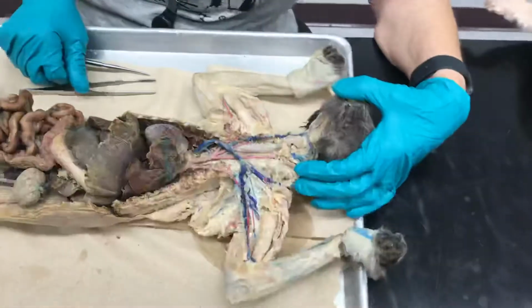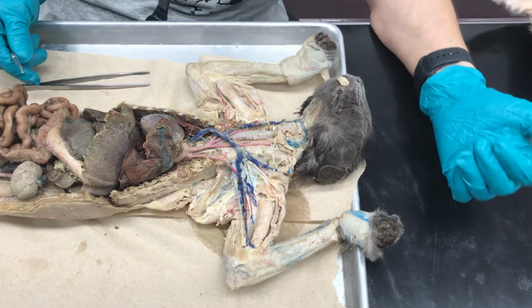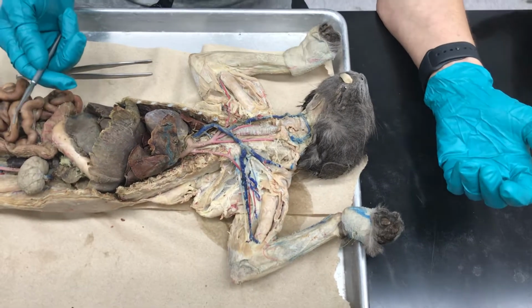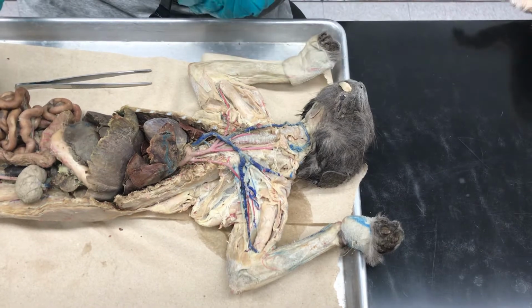We are going to look at cat vessels now. Cats and humans have basically the same vessels, and it's really beneficial to look at them on the cat because we obviously can't look at them on the human. What I'm going to do is we'll do this in two separate videos. We'll do arteries and then we'll do veins.